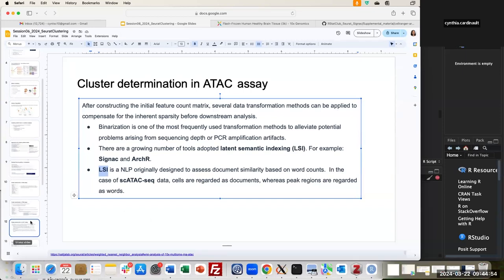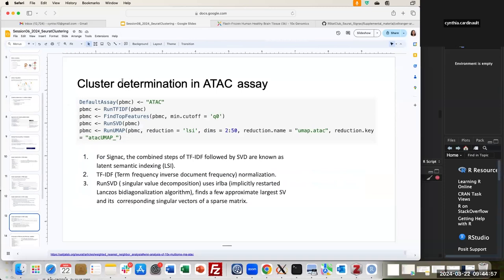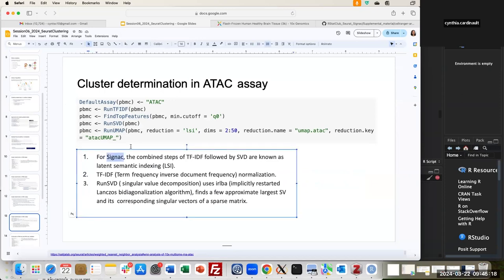The steps to perform LSI are: run the RunTFIDF command followed by finding top features, and then run the SVD. In Signac, which has these commands, it's a combination of these transformation steps — the TF-IDF followed by SVD — that together constitute what is called the Latent Semantic Index. The TF-IDF normalization implements conversion to the binarization approach, and then singular value decomposition looks for the eigenvectors corresponding to the sparse matrix.